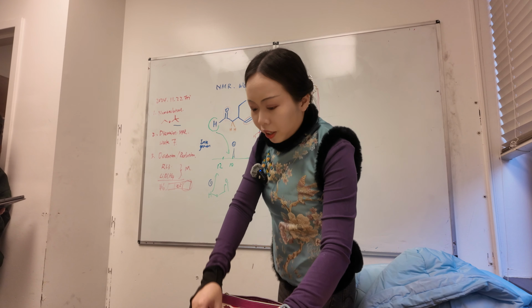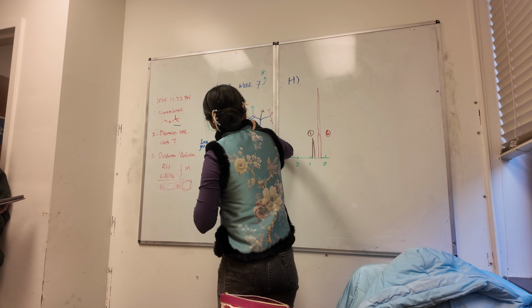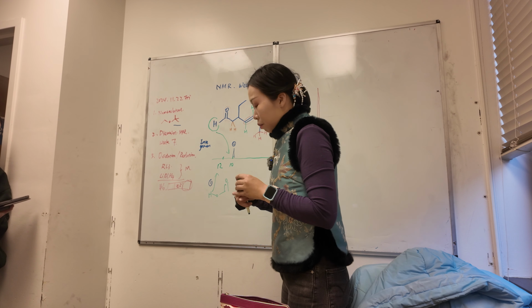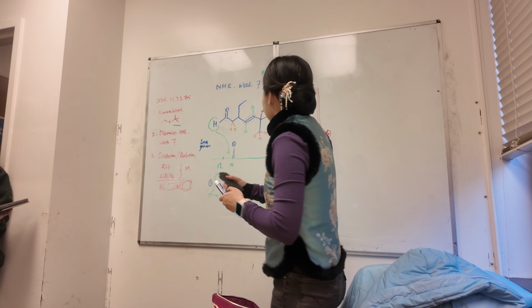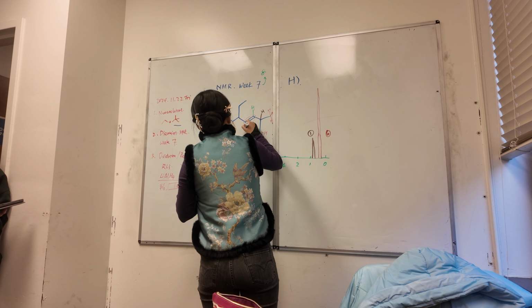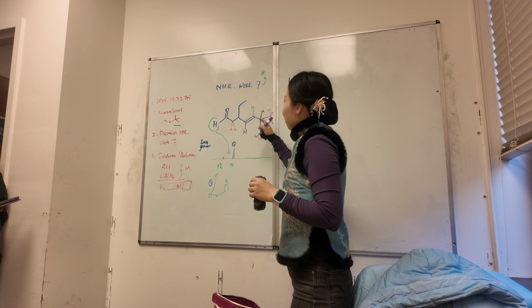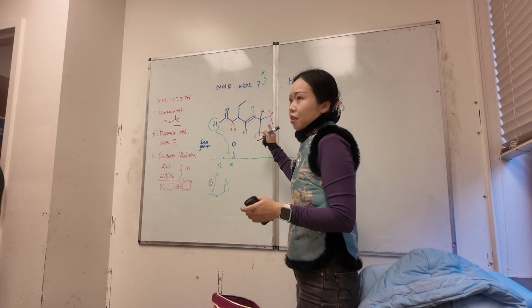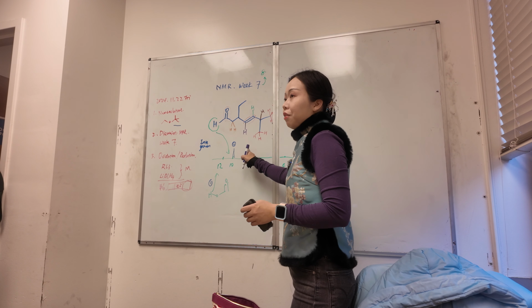Okay, the 2 hydrogens on this have 2 different peaks. I'll use a green and a purple. All right. If you refer to your note card, you will see a really broad range for this. It says it can go from 2 to 4 or even higher.